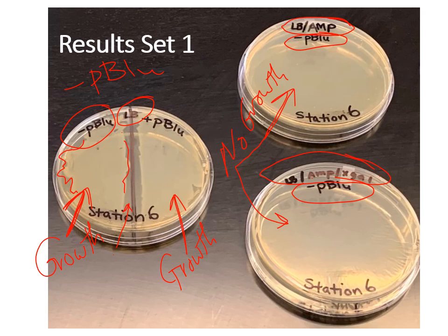Okay, so I'll ask you to analyze these plates, and when you analyze any results, you want to be specific to each plate that you see. You want to be specific about what that plate contains, and you want to be specific as to was that what you were expecting or not, and what might have gone wrong. Okay, so analyzing includes all of those things.